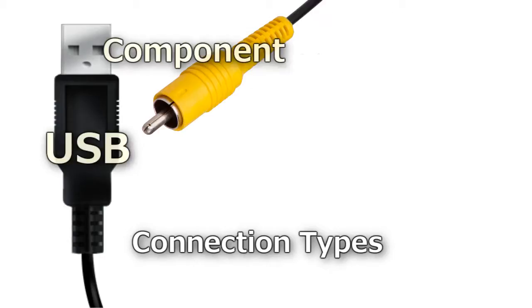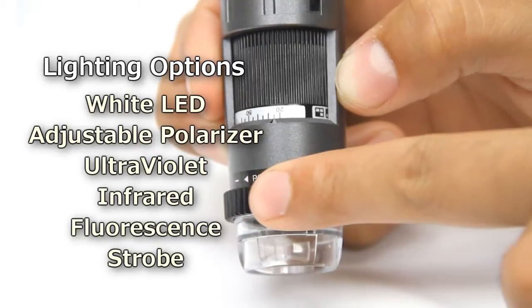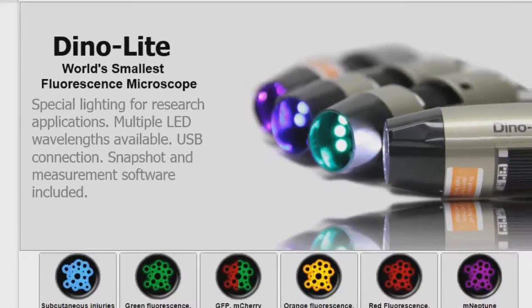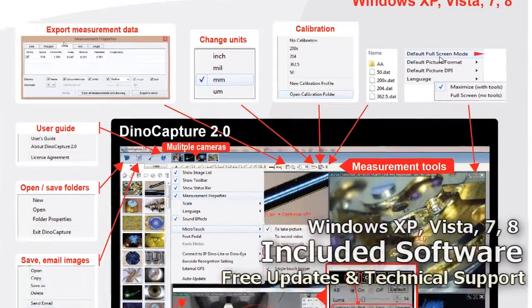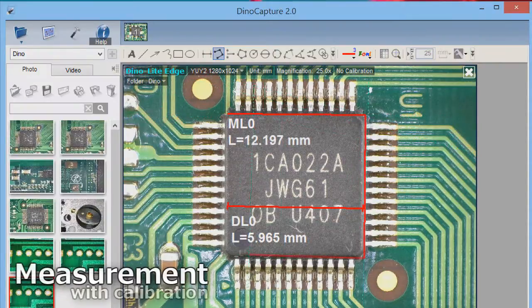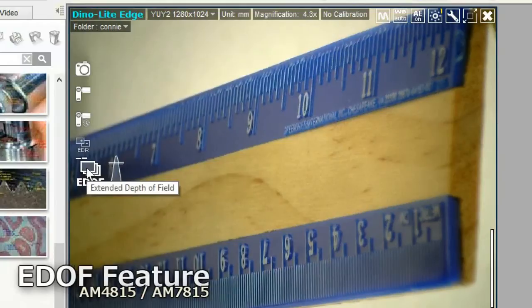There are over 70 different models to choose from, including features such as polarization, varied magnification and working distance, fluorescent ultraviolet and infrared lighting, medical microscopes, as well as software-specific feature models. USB models are the most commonly used DinoLites. They're connected to a computer and include feature-rich software with tools such as image and video capture, as well as measurement and analysis.